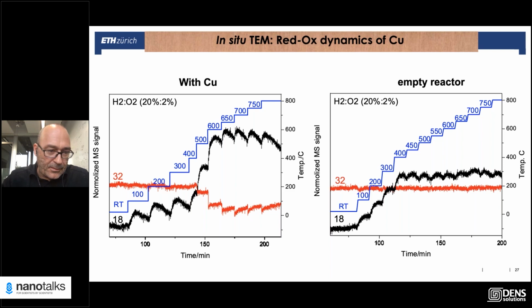And you see here, don't really look at the oxygen and the water signal. It's not extremely beautiful with some background issues. When you heat up every surface, there's some water desorption, but at around some temperature, the water formation goes up. More trustable is the oxygen signal. So the oxygen signal, we can see there is no consumption of oxygen up to around 400 degrees, similar to the ESEM, the SEM videos that I showed you before. At around 400 degrees, you see that the consumption of oxygen starts to happen, and you consume, in this case, oxygen by hydrogen, you form water.